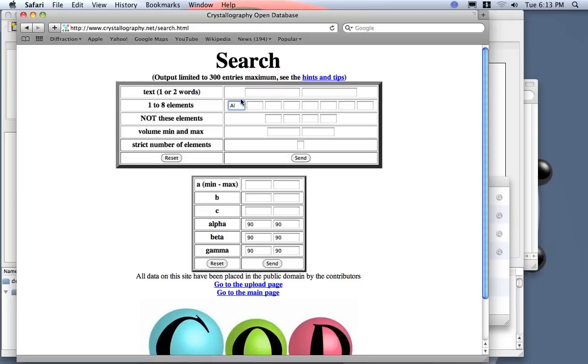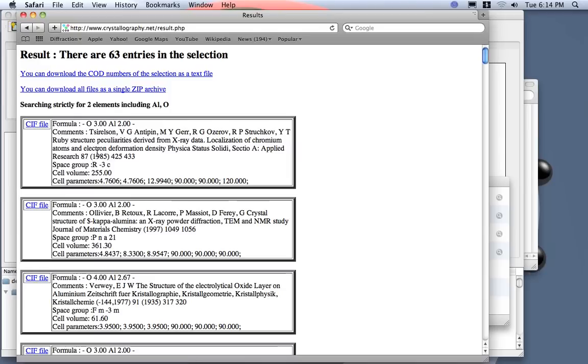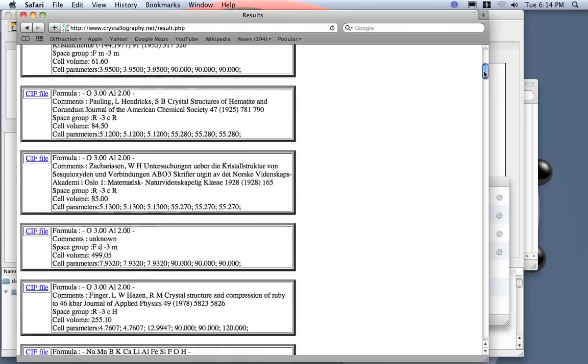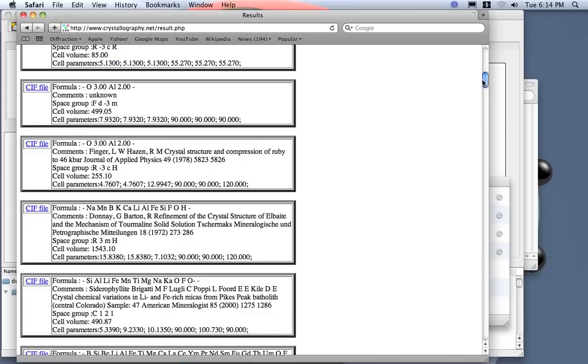So, for example, I search for the chemical composition, so I put aluminum oxide. I specify that I want just compound with only two elements, so only aluminum and oxide. Send, and then I got a lot of these phases.